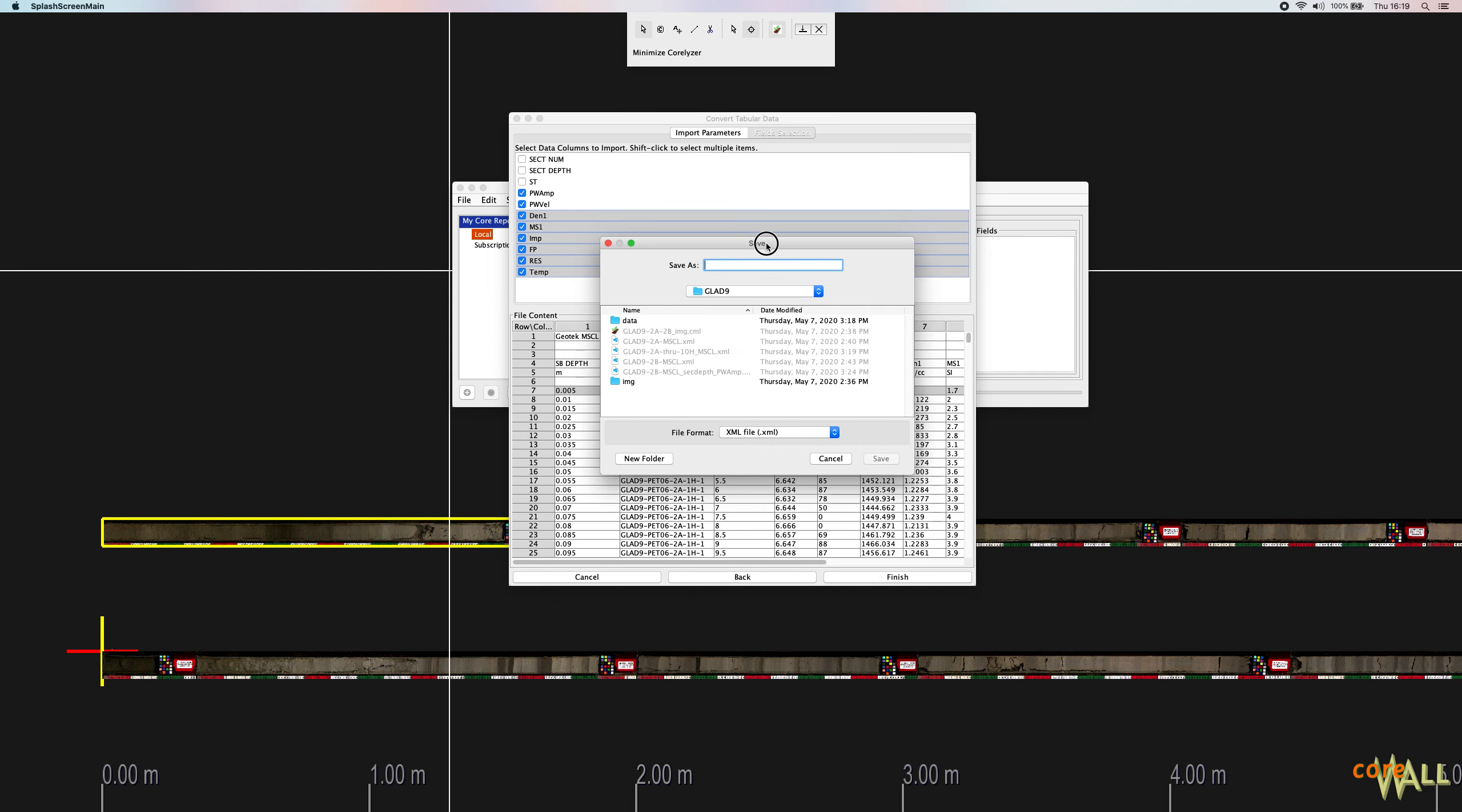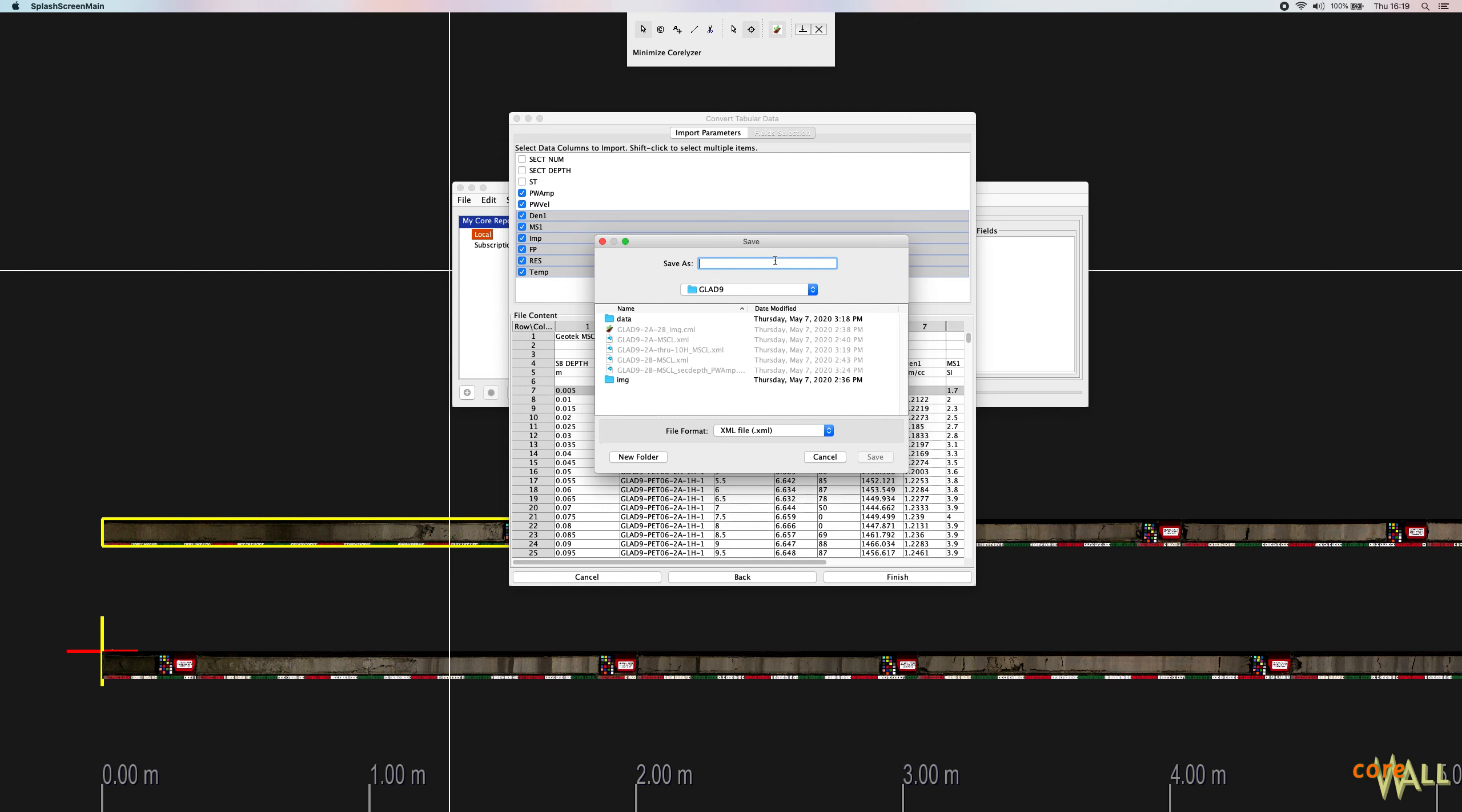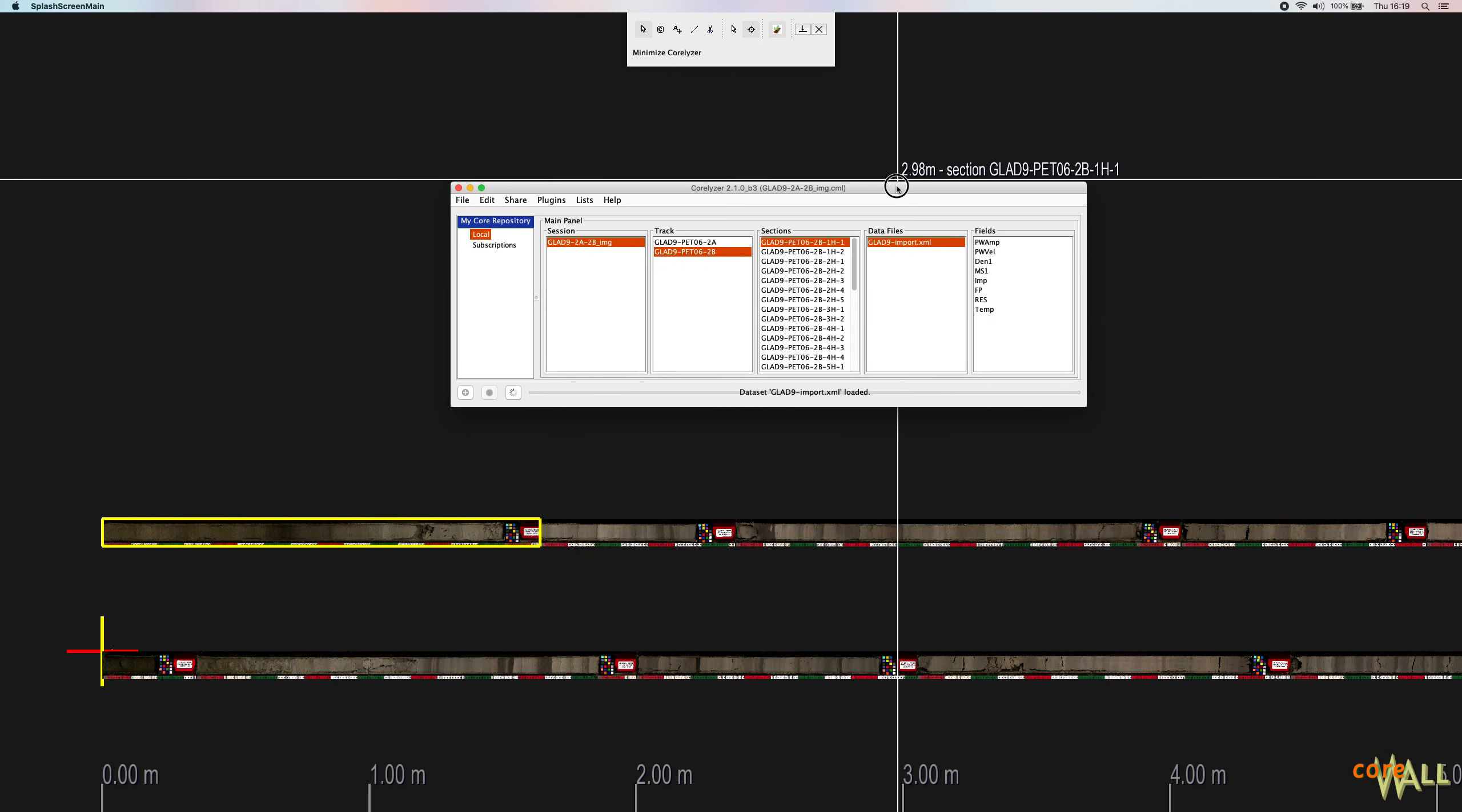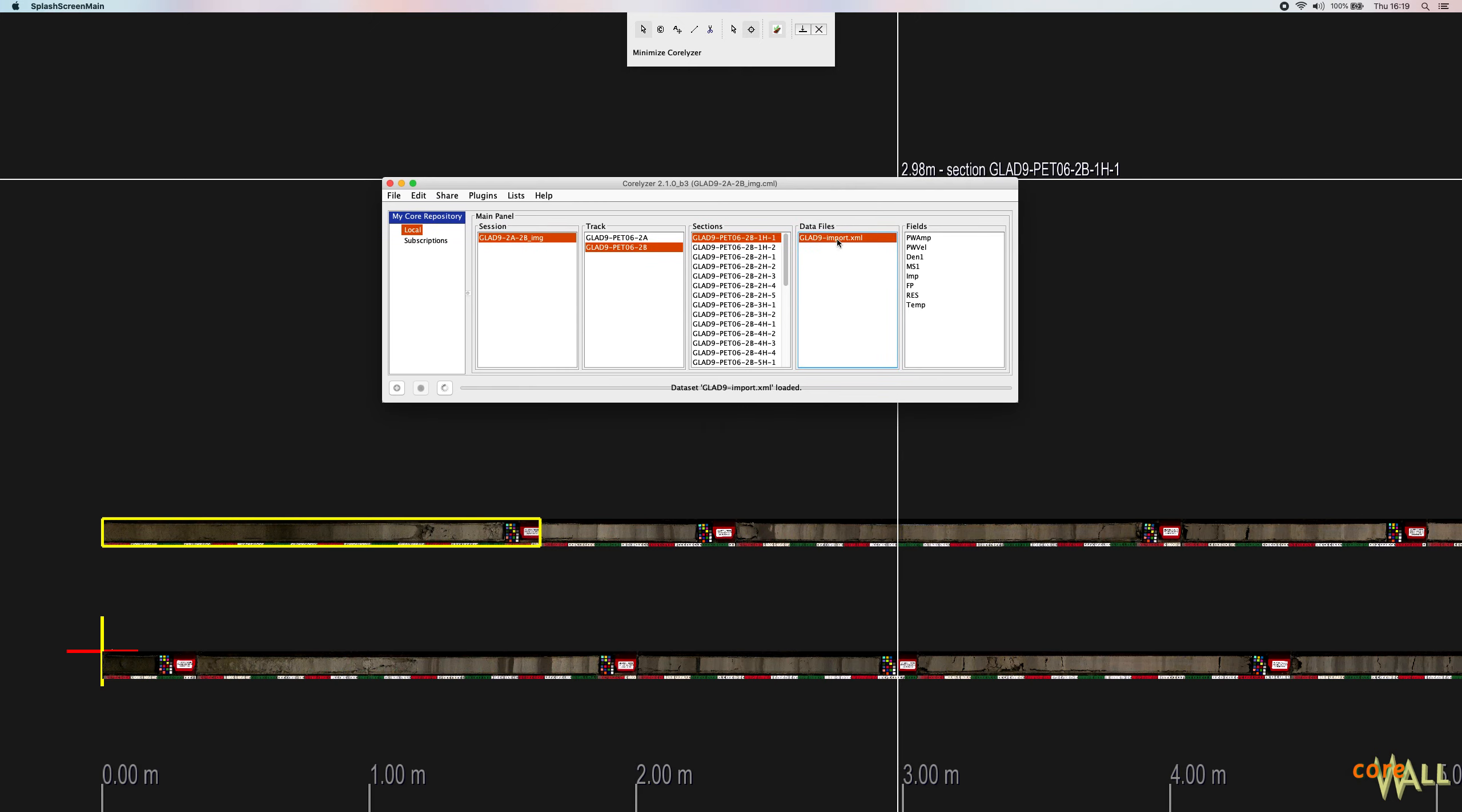So now choose a location to save the generated XML file. We recommend saving it alongside the original CSV file. Save this as Glade 9 import. And click Save. Once you do this, the dialog will close and that file will be immediately imported into your current session. So as you can see, I have my Glade 9 import file here.